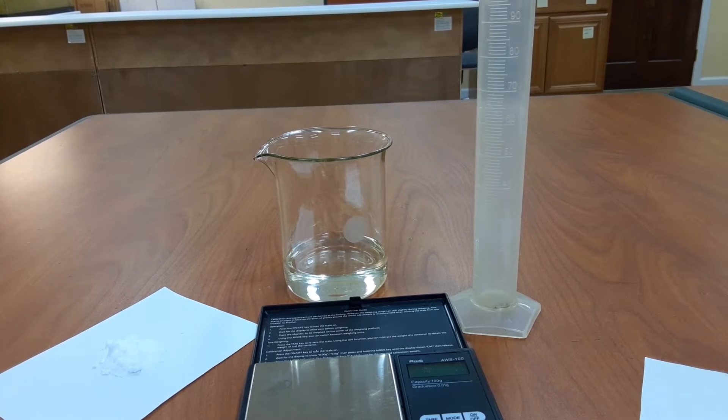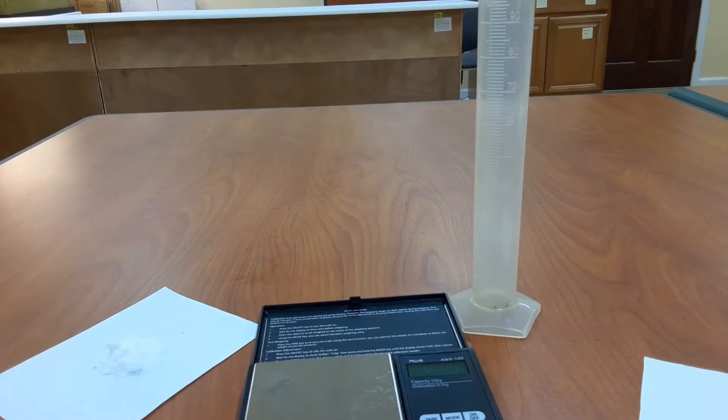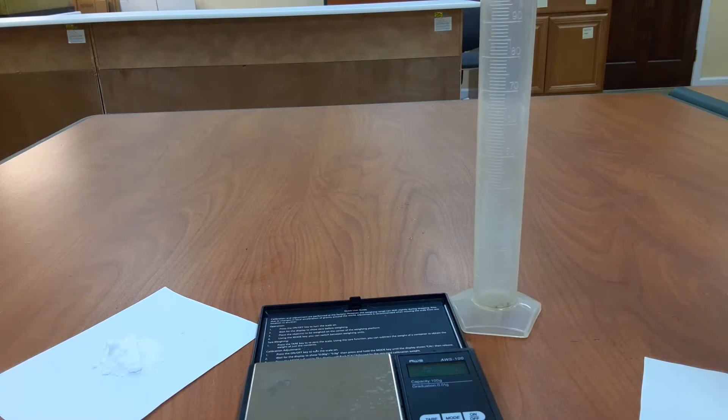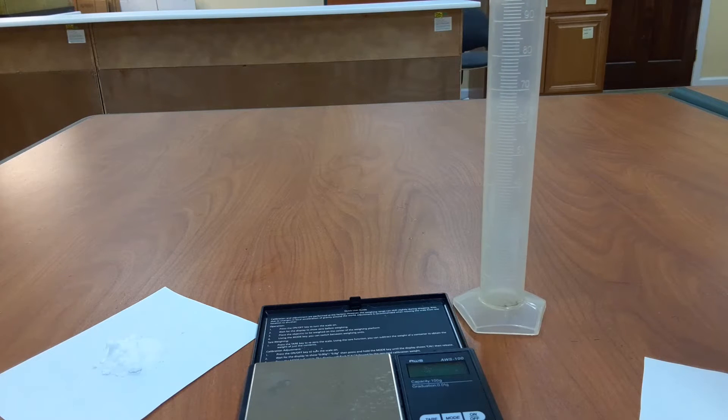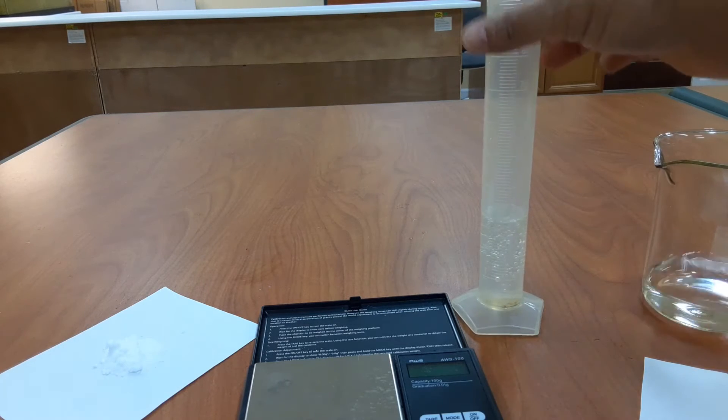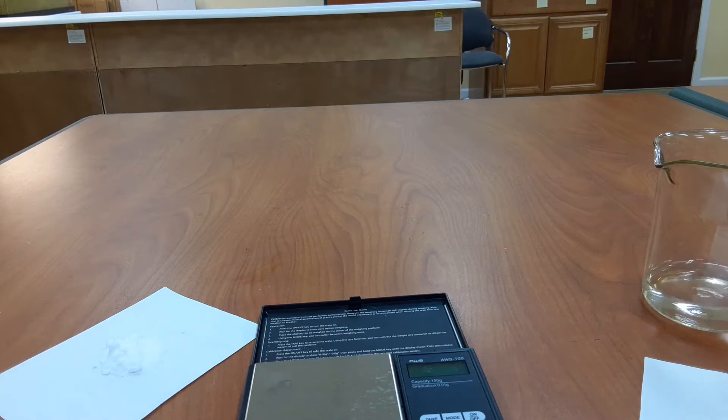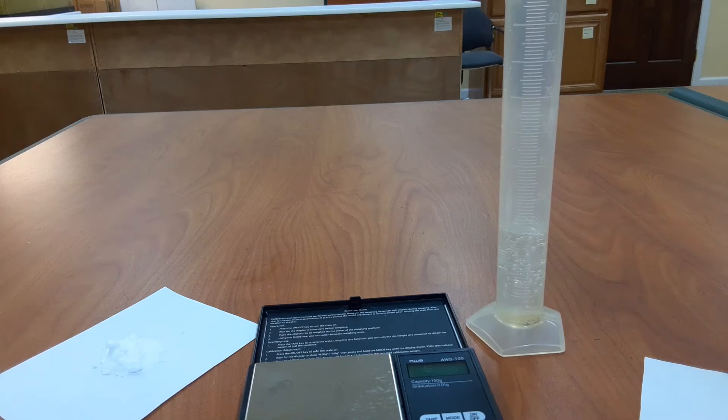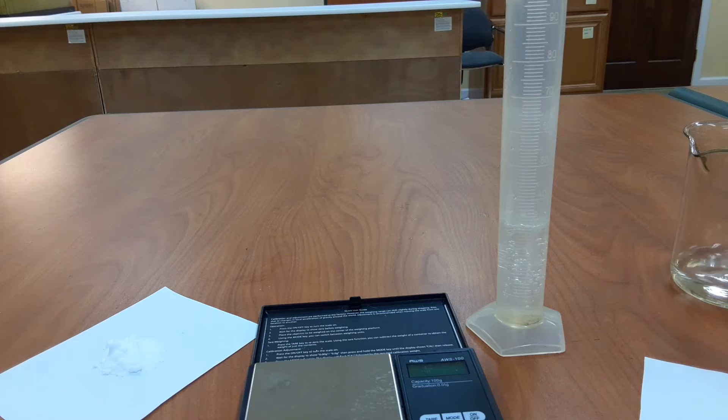To start the experiment, we will take our vinegar and pour about 30 ml into the graduated cylinder. It does not have to be exactly 30 ml, but we do not want to be too far off from 30 ml either. I'm just pouring the vinegar into the graduated cylinder, and I have about 30 ml. As I said, the exact amount of vinegar in the measuring cylinder does not really matter.